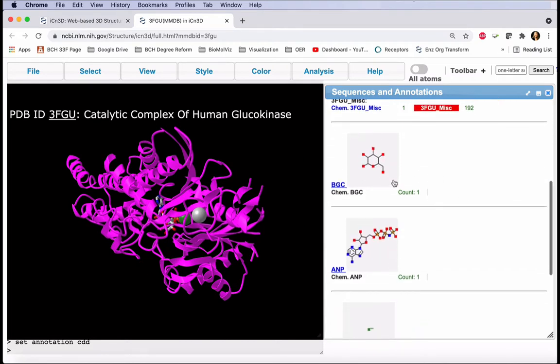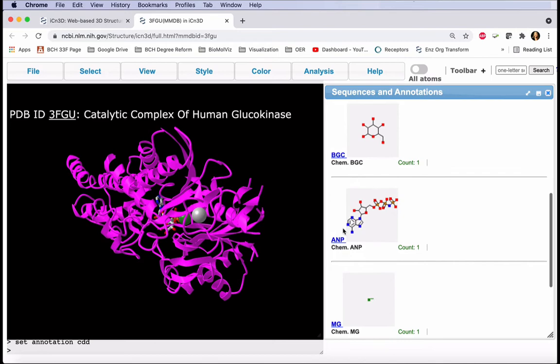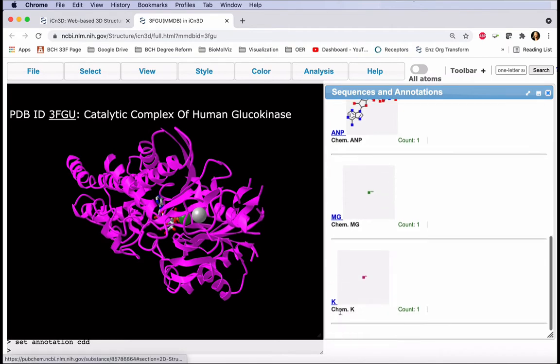Our ligands appear at the bottom. We can see BCG, ANP, MG, and K.